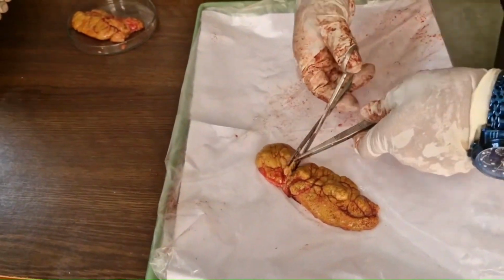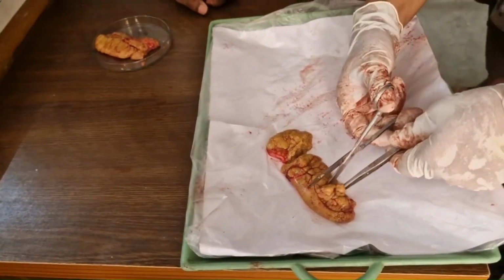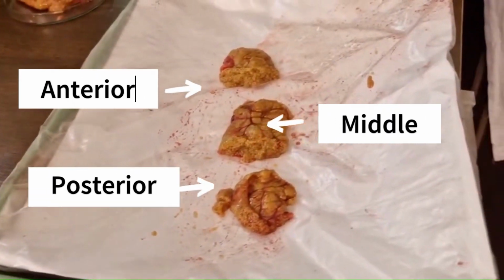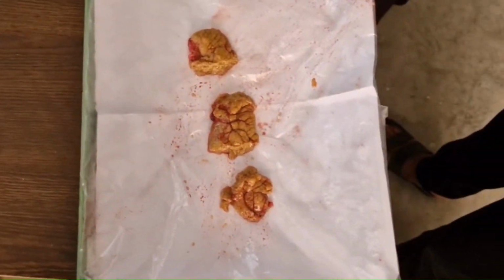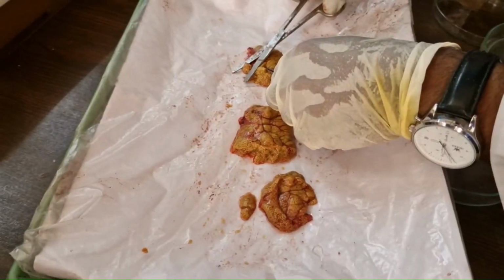Then we cut each of the lobes into 3 portions: anterior, middle and posterior. And then randomly took 3 subsamples from each portion. We denoted the subsamples of both lobes as F1, F2, F3, F4, F5 and F6. From the anterior lobe, we weighed the subsamples.